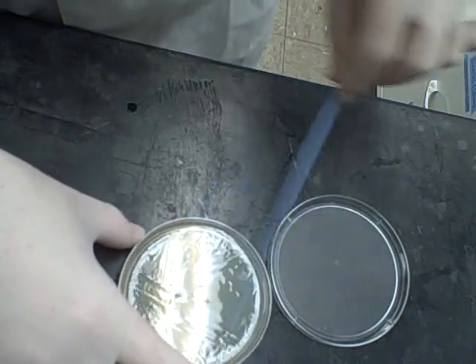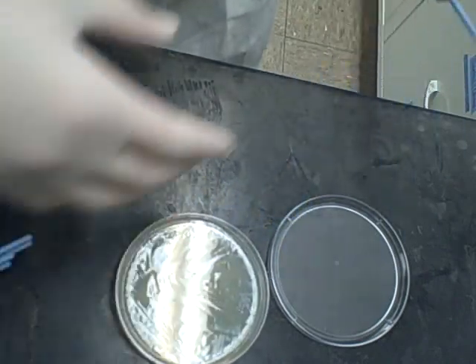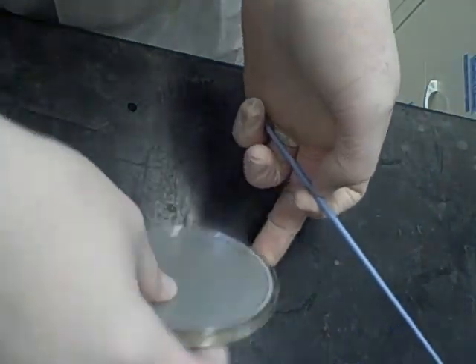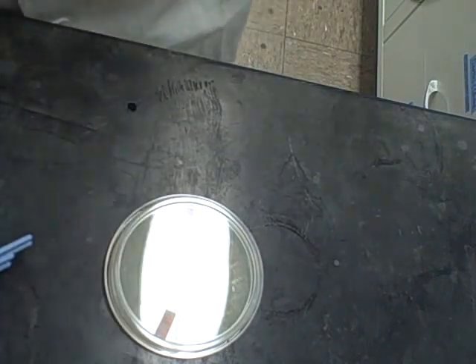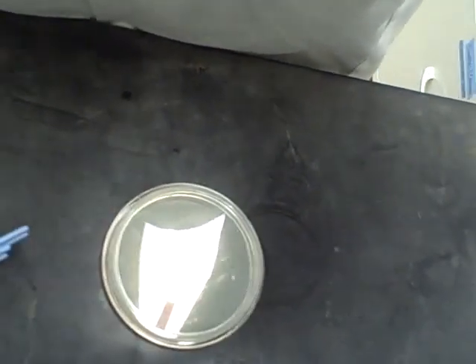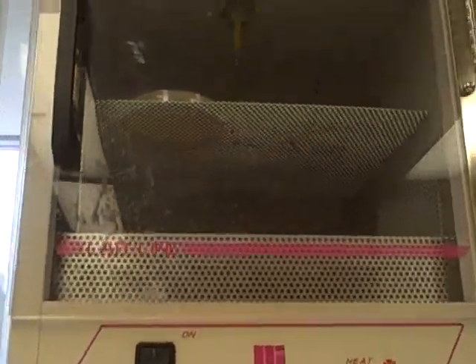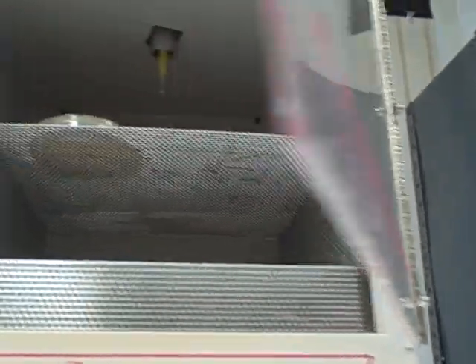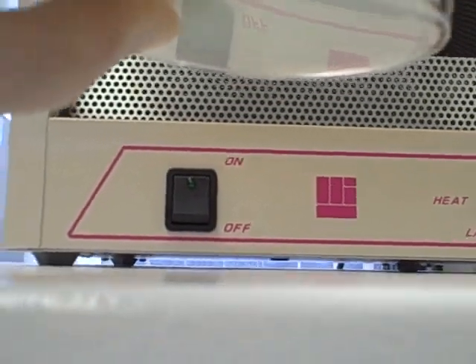So now what you're doing is selecting for antibiotic resistance. Basically, the ampicillin in the plate is going to kill the cells that haven't incorporated the ampicillin resistance gene, and it'll leave the cells living that have incorporated the ampicillin resistance gene. We're now going to take our plate and stick it in our incubator at 37 degrees, setting it bottom side up — agar on top, lid on the bottom.